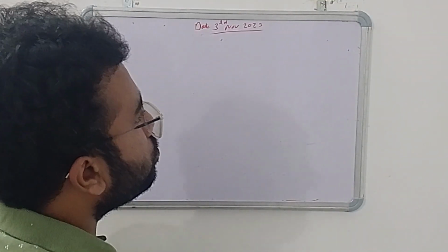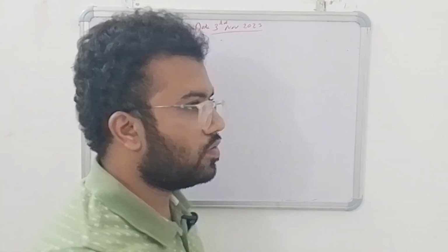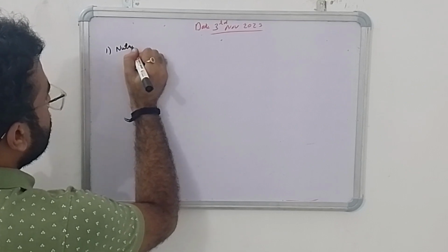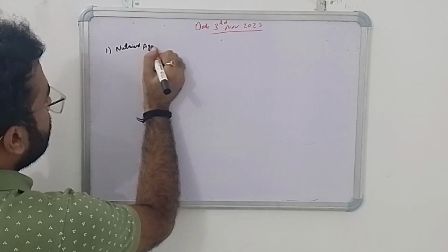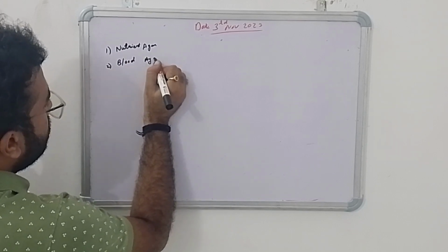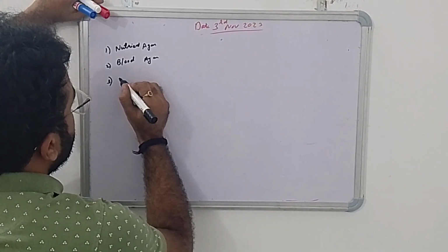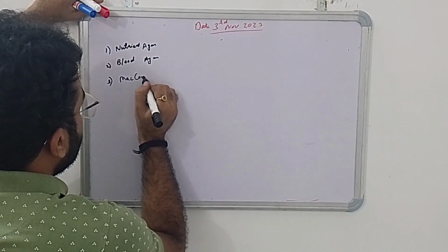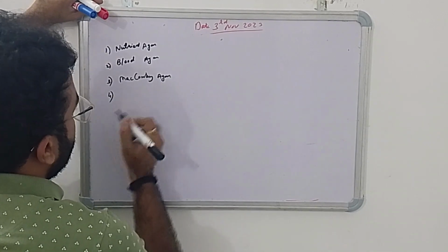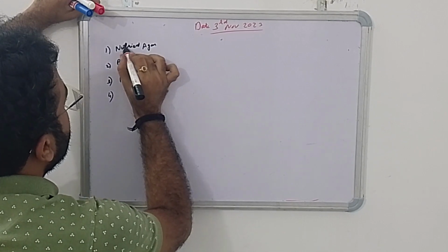Now we are moving towards the different agars of Staphylococcus. Nutrient agar, blood agar, and MacConkey agar.